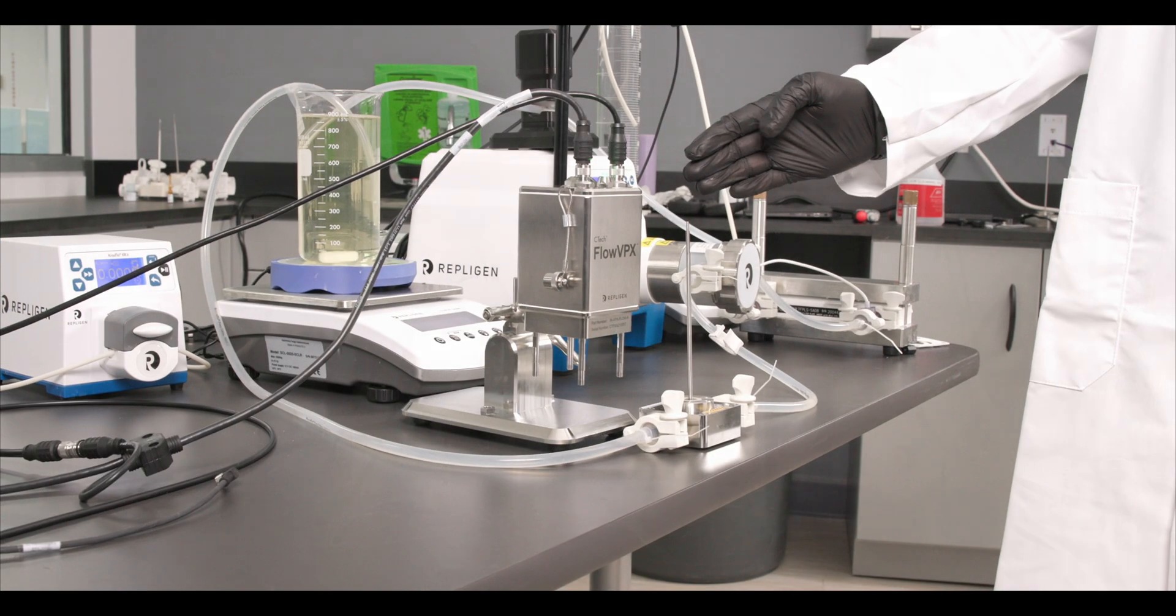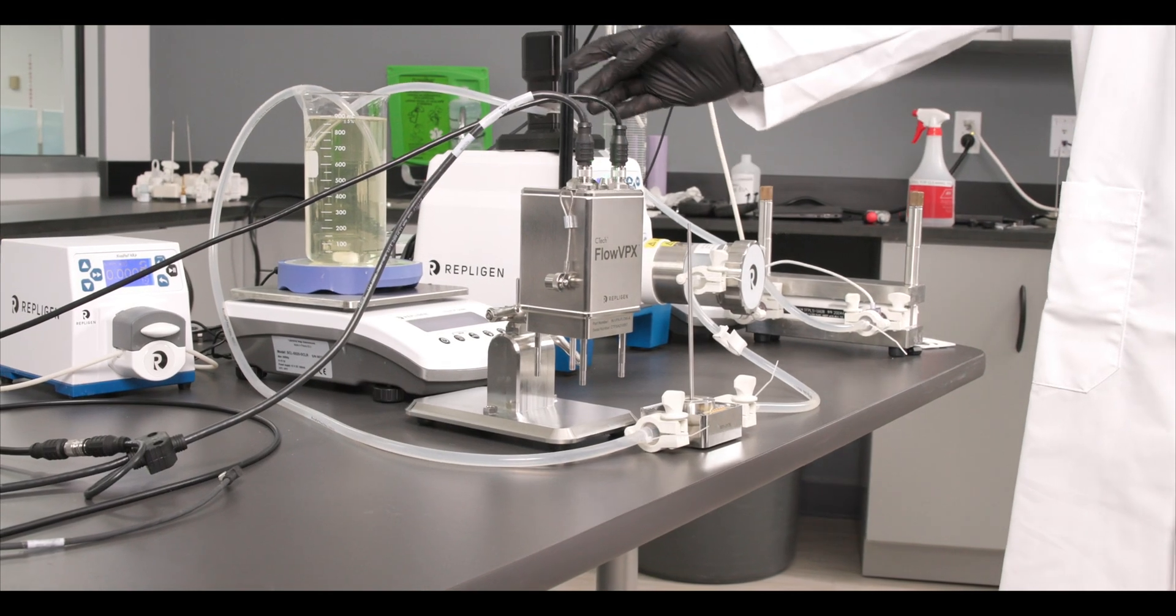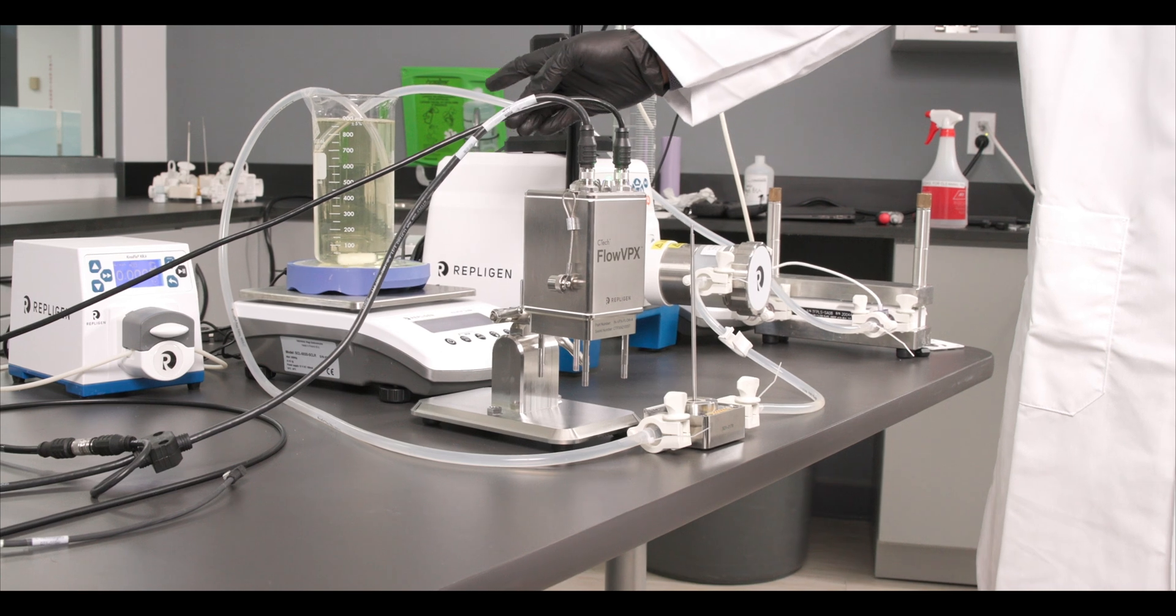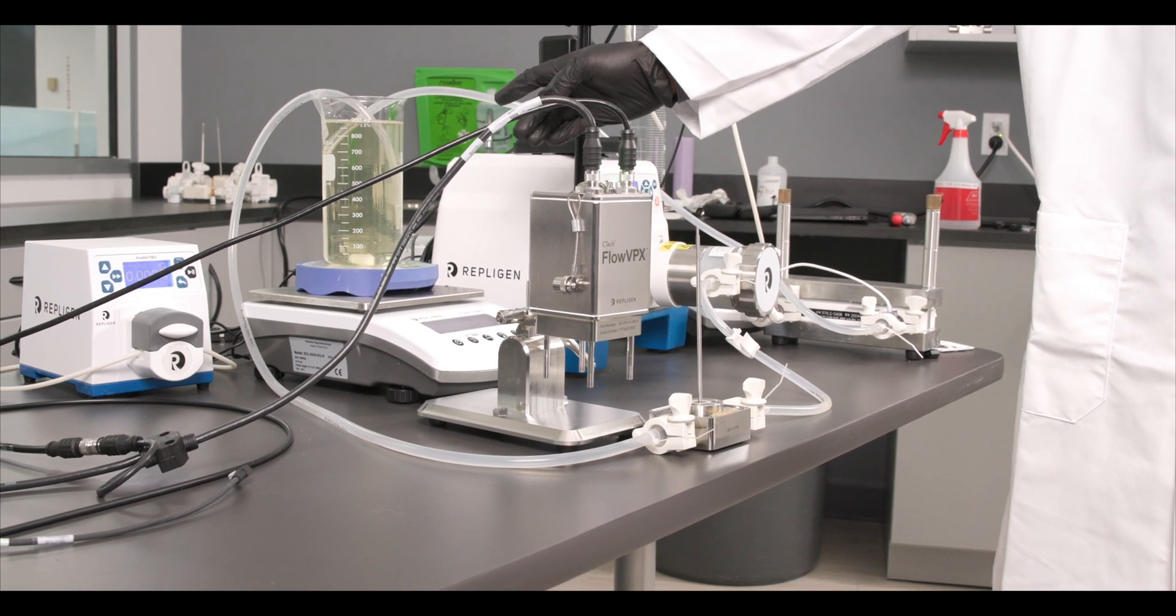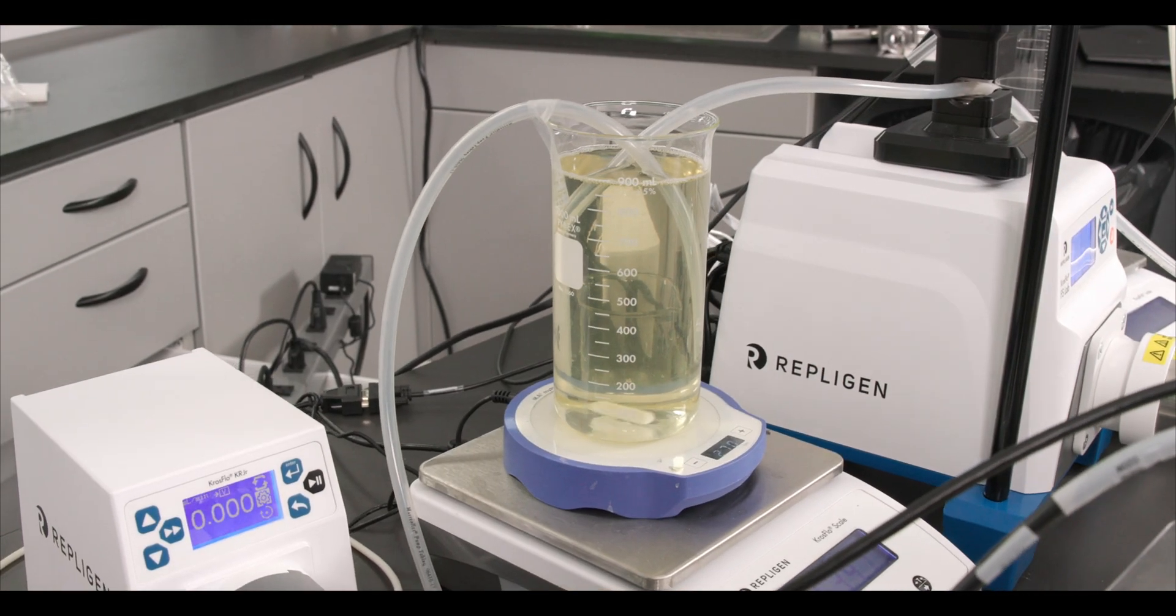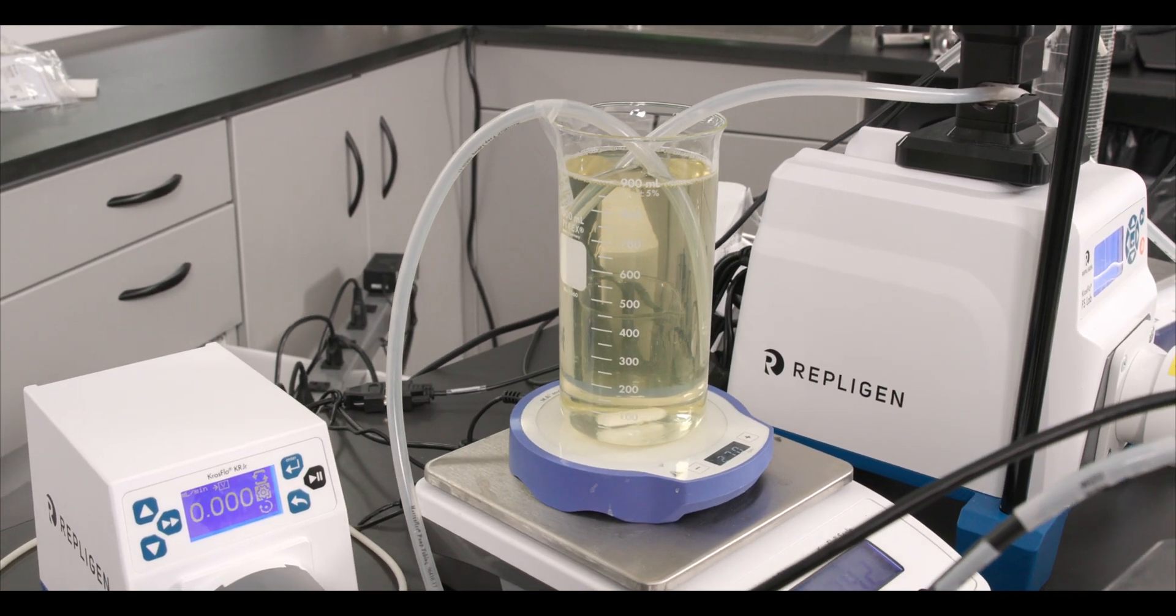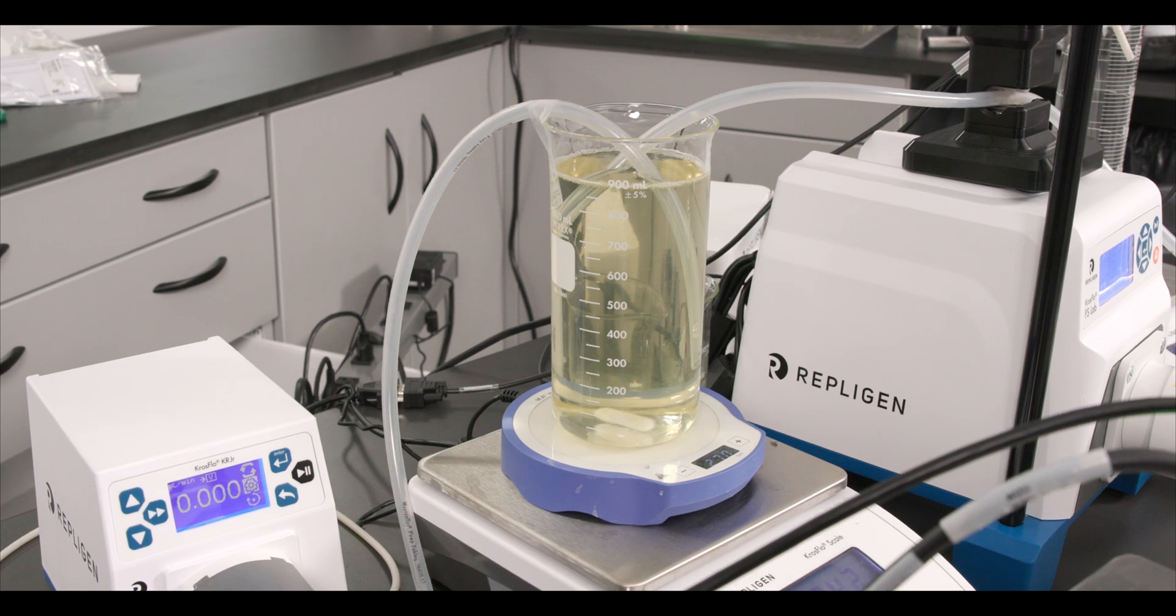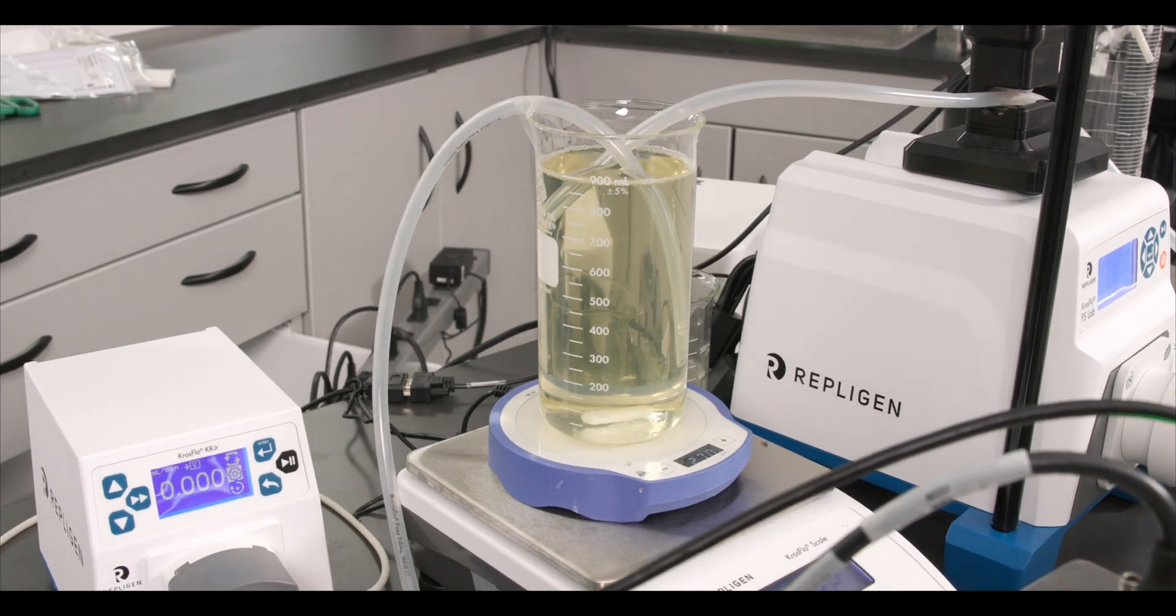For today's UFDF run we will be using bovine serum albumin BSA at a starting concentration of 40 mg per ml and a starting volume of 1000 milliliters.